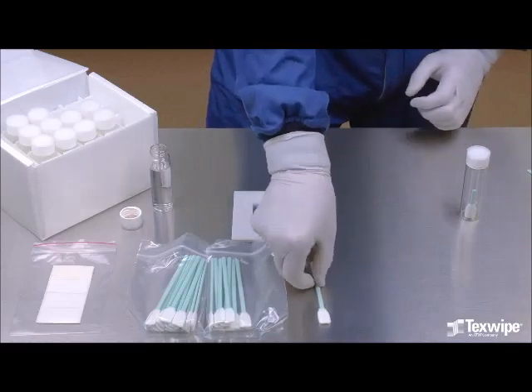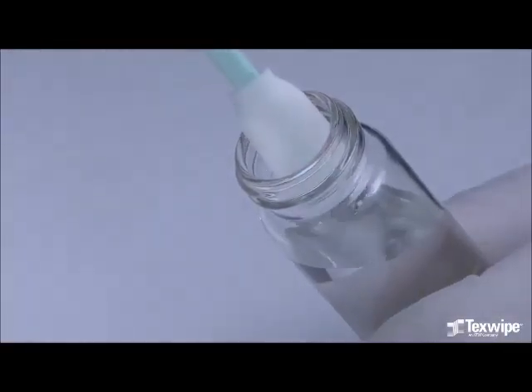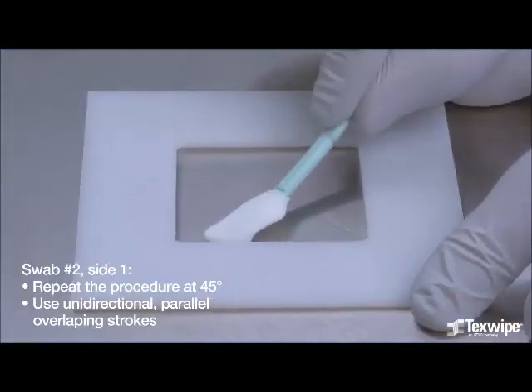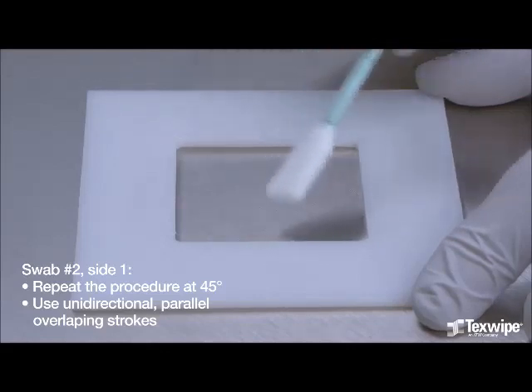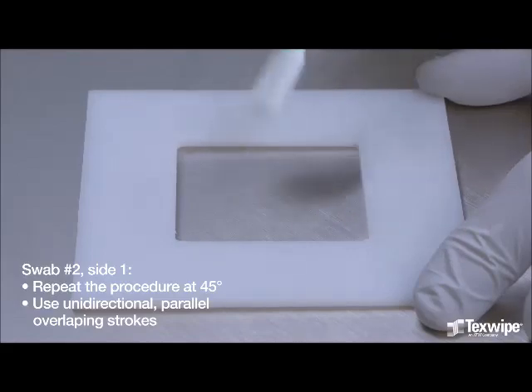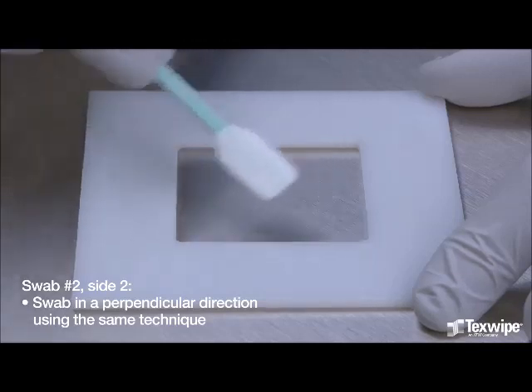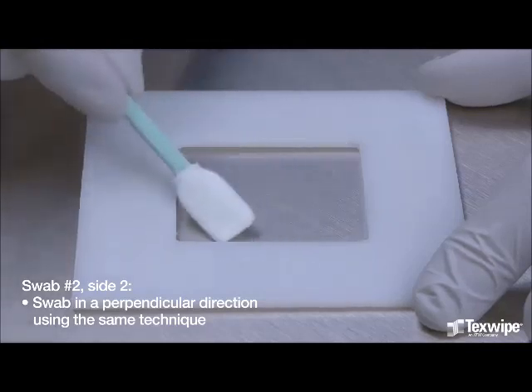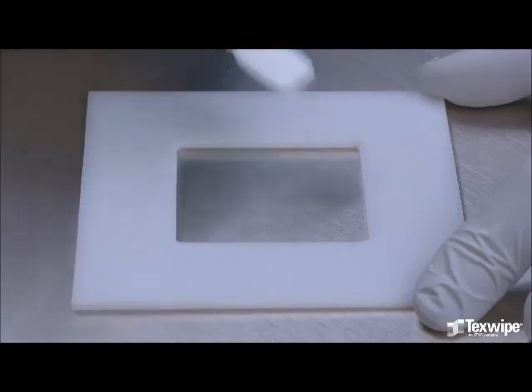Take the second swab, dampen the swab, remove the excess water, and repeat the same sampling procedure at a 45 degree angle. This is the first side of the second swab. Using unidirectional, parallel, overlapping strokes is important for good TOC recovery. Flip the swab over and swab in a perpendicular direction using the same technique, keeping the entire swab head flat against the testing surface. This is the second side of the second swab.